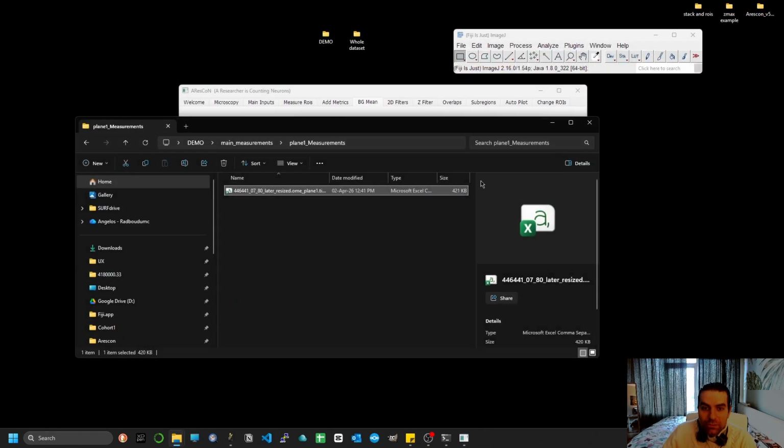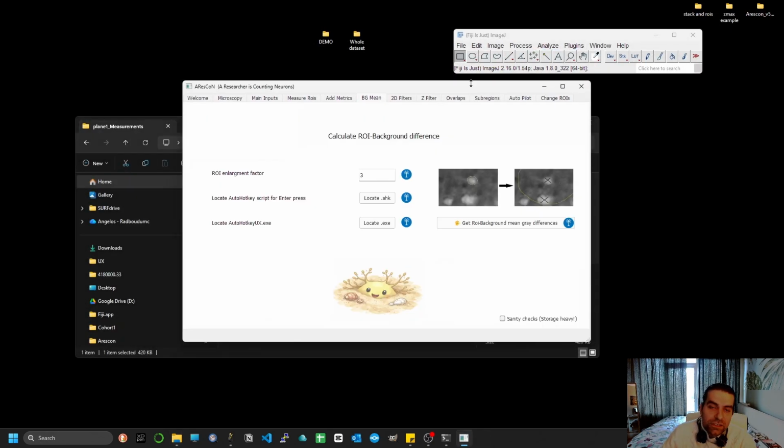Now, before I jump to the next step, I should say that this step that we run includes a stage of thresholding. And this stage of thresholding works well for my images, but it might not work well for your images. It should, but it's not guaranteed. Okay? This is about thresholding in ImageJ. What you want to have is a threshold method that creates particles, like the analyze particles option of ImageJ.